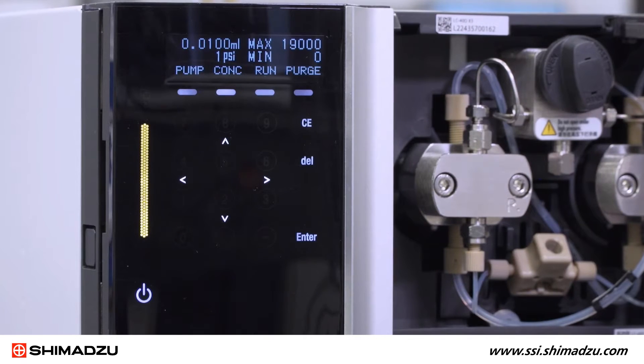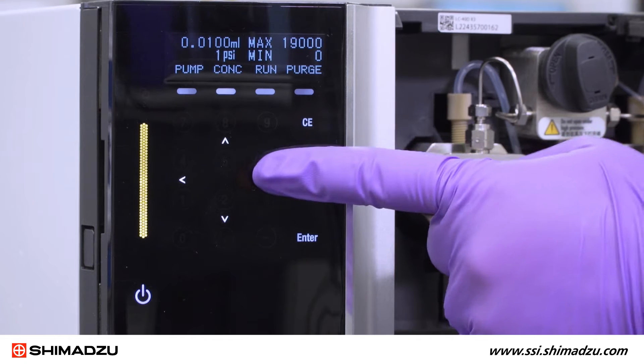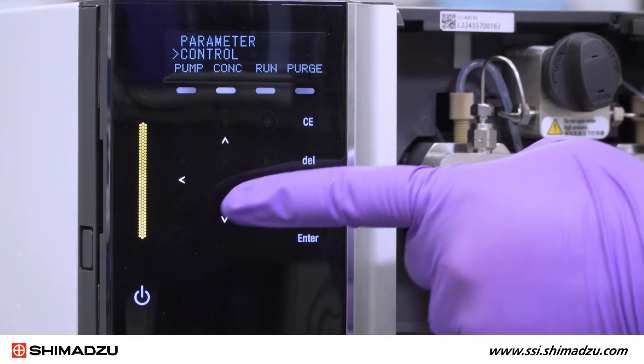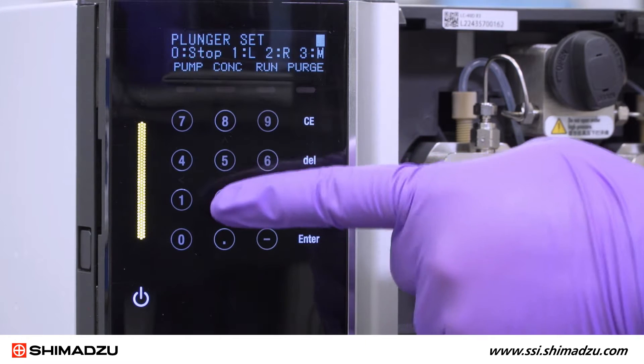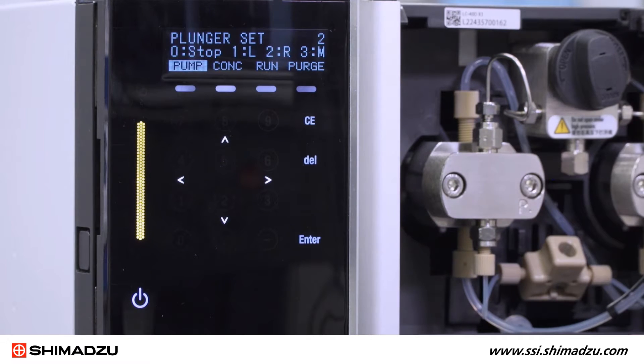Now you can begin the procedure by setting the right plunger to the back position using the instrument control panel. Using the keypad and arrow keys, select Function Control Plunger Set. Then press 2 and hit Enter. The right plunger should now be retracted as far as possible.